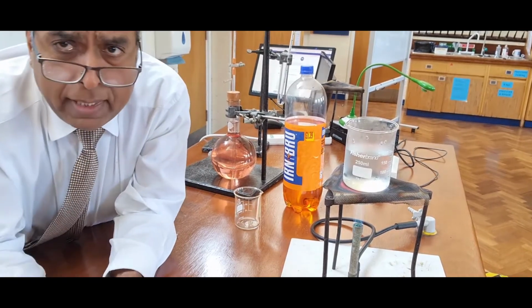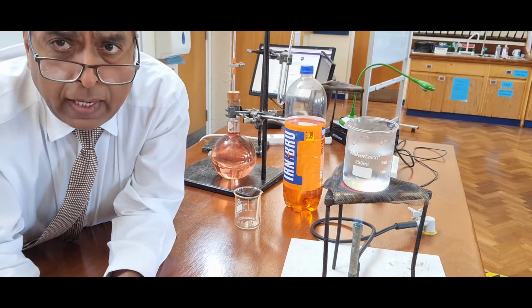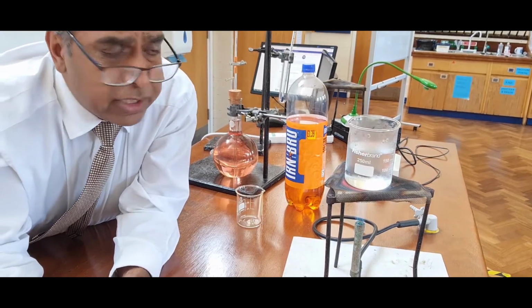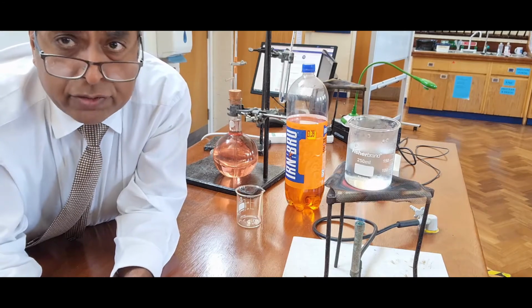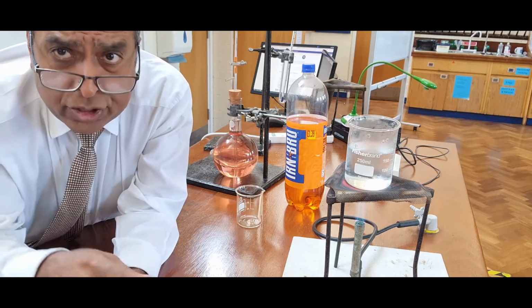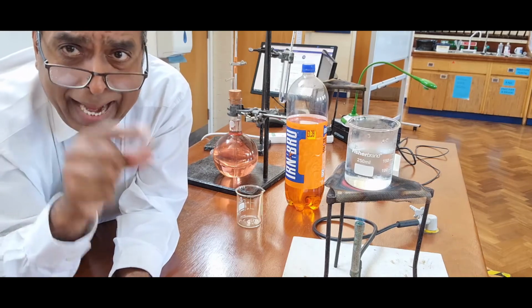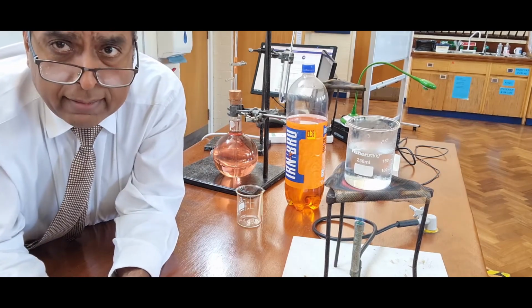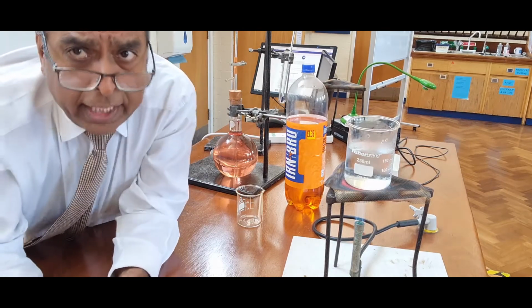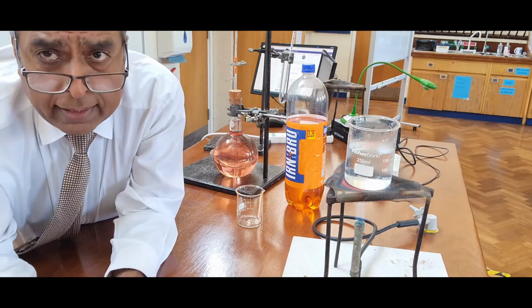Look at my previous video and I'll take you through these ideas theoretically there. This is an opportunity for us to show you some practical. Where things dissolve, we have to stipulate how much solvent to take. And the internationally agreed standard is to take 100 grams of water.